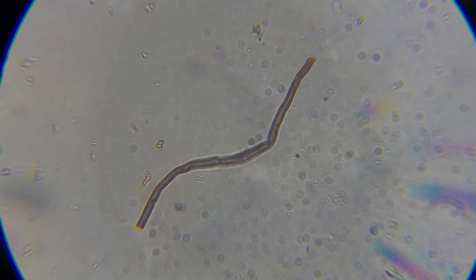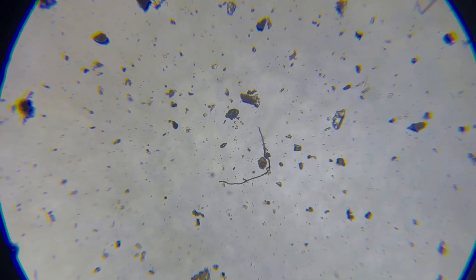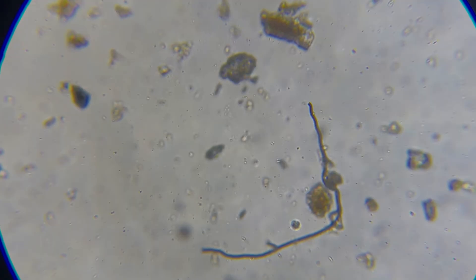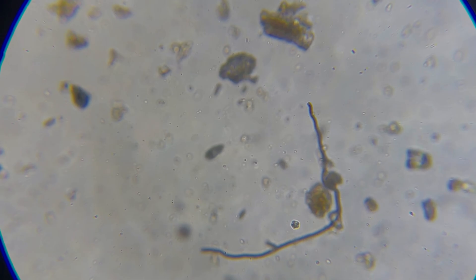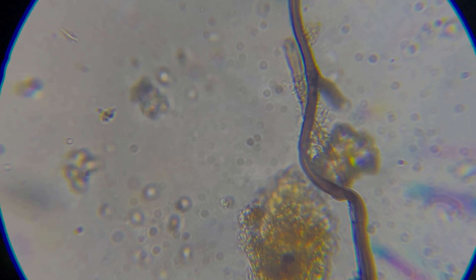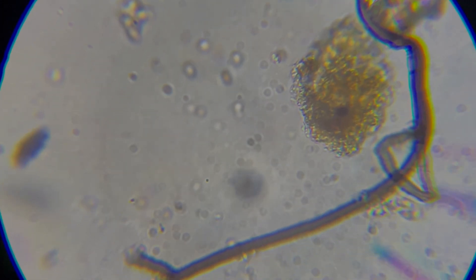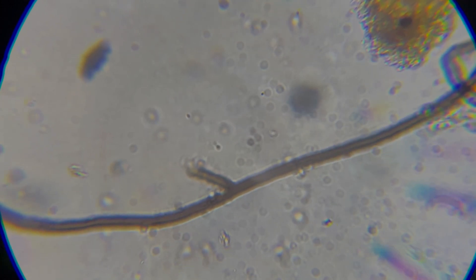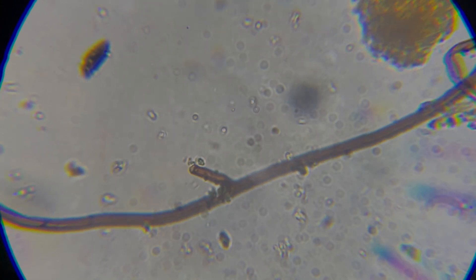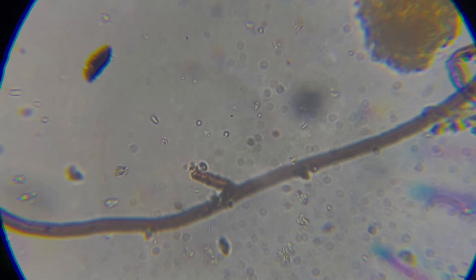When looking at our fungi, we can see some septation and squared-off ends. Here's a larger piece first at 40x magnification, then 100x, then 400x total magnification. You can see the color, the uniform diameter, and the branching — all signs that this piece of fungi is beneficial. This is what we really like to see in our samples: everything looking good, which means these organisms are going to be really beneficial for our plants.